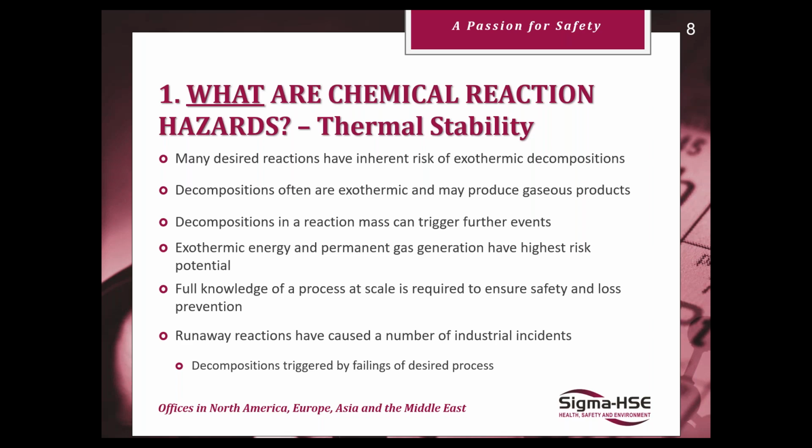So finally, runaway reactions have caused a number of industrial incidents over the years. And these runaway reactions tend to be caused by decompositions triggered by failings of a desired process. And again, we'll talk a bit about that kind of mechanism later on in the application of the data.